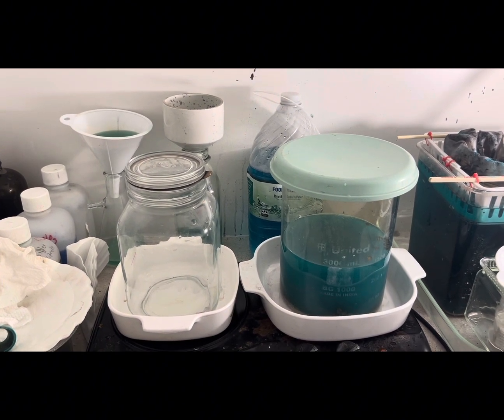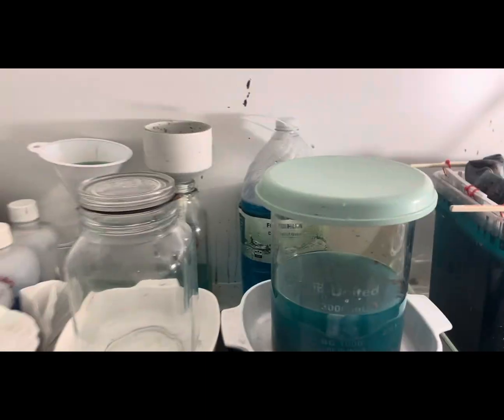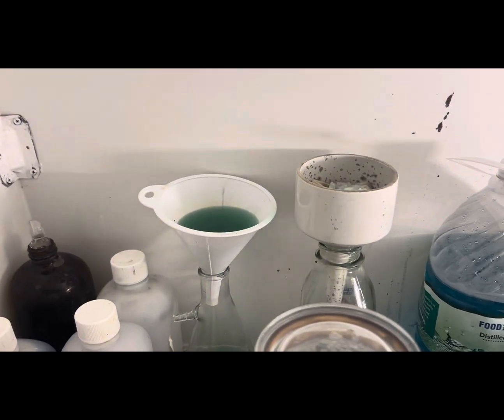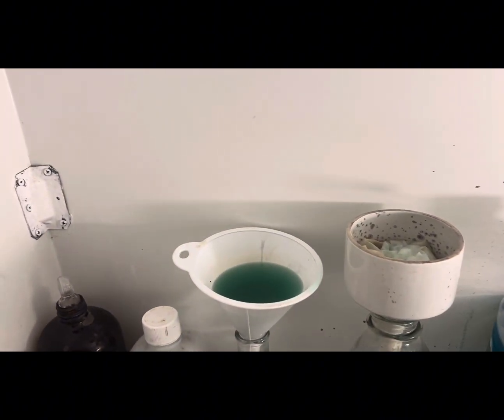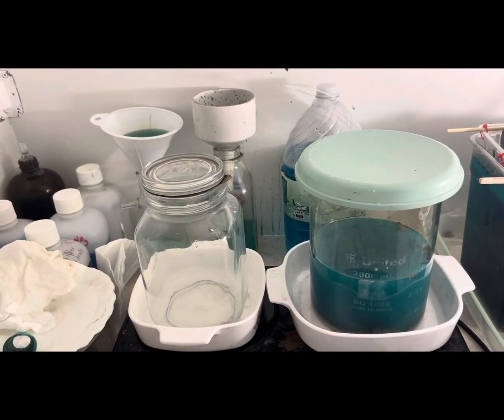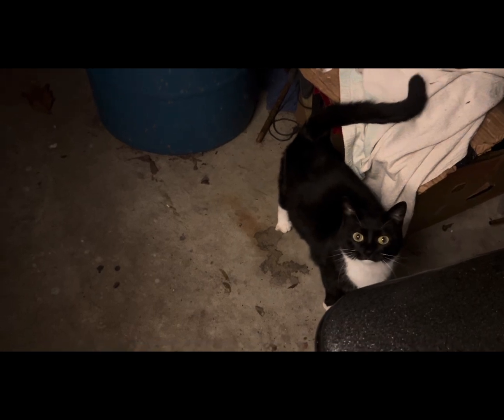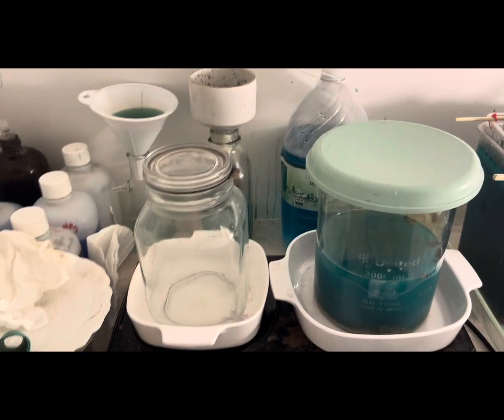We are cementing out that silver from the silver slimes. It looks like there's just a little bit of nitric in there — you can see a little bit of orange haze and some activity in that beaker. I'm trying to filter out the solution to put into the beaker. I'm done with this for the night — we're just going to let that clear up and I'll mess with it in the morning. Say hello to my lab cat — she's the half-feral cat that cannot get along with anyone, and she apparently likes to talk during videos. Let's go back to chemistry.